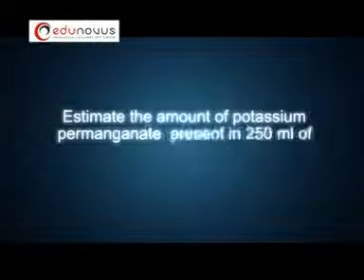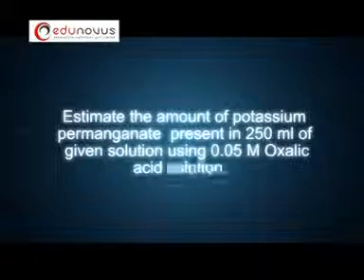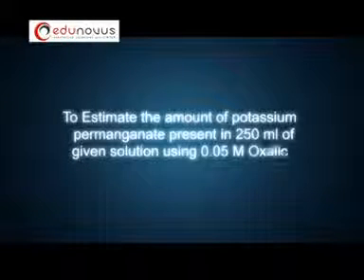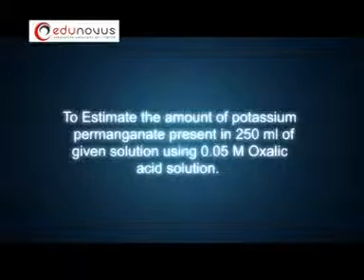The question is, aim to estimate the amount of potassium permanganate present in 250 ml of given solution by using 0.05 M oxalic acid.